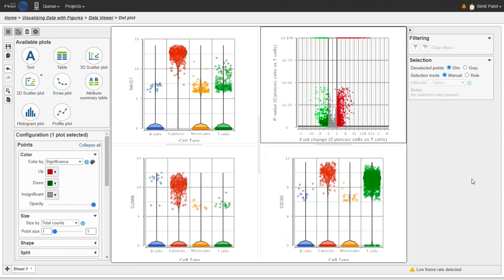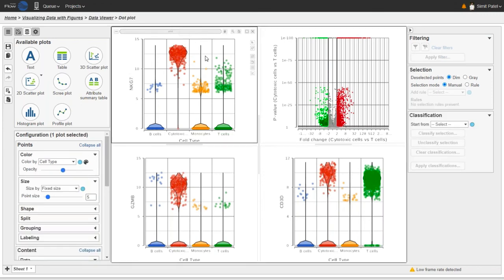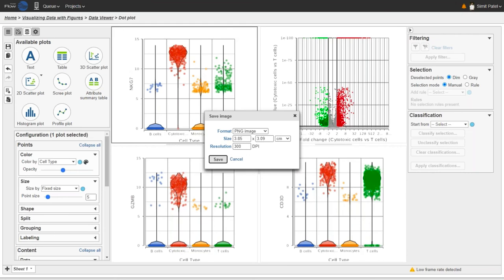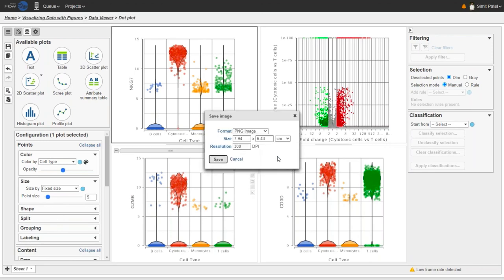To export an individual image file — for example saving this dot plot or violin plot — click the Save Image icon up here. This will export the image as a PNG, SVG, or PDF file. You can configure the resolution, click Save, and it will be exported through the web browser and downloaded to your local machine. To export the entire canvas — all four images as a single image file — click the Save Image icon on the left, and that works in exactly the same way.